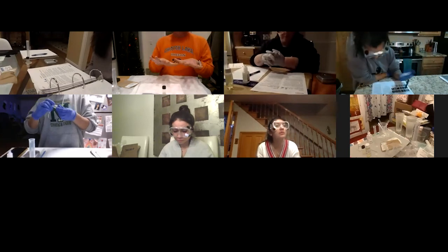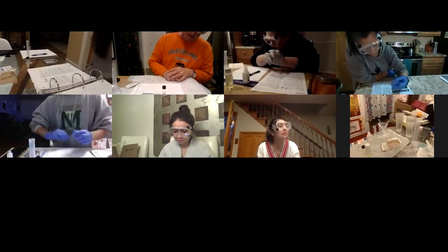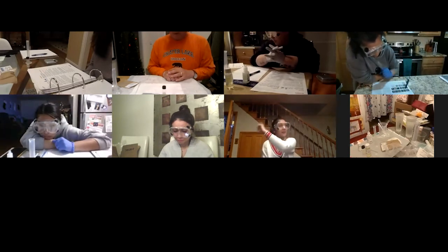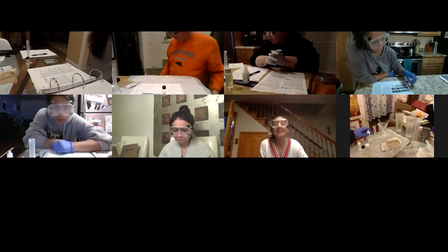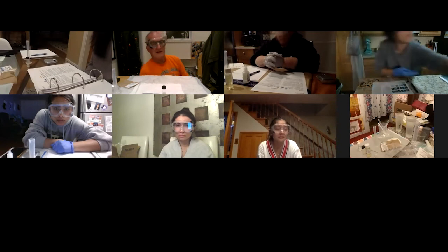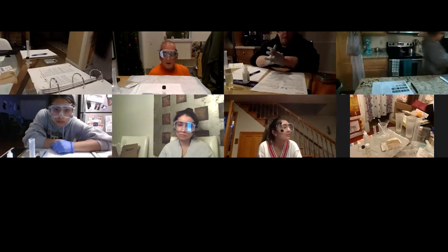Basically we want it to separate, calm down, then we're going to shake it again. I'm going to give it 2 more shakes. I don't think it's necessary to keep this in the dark.